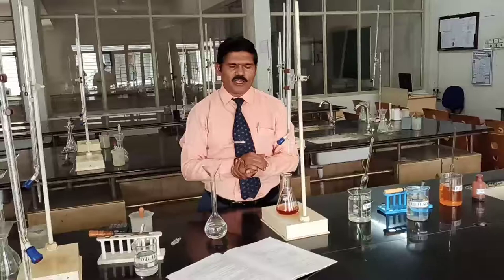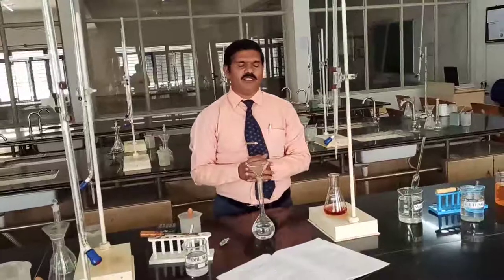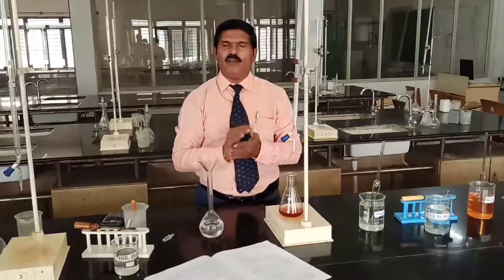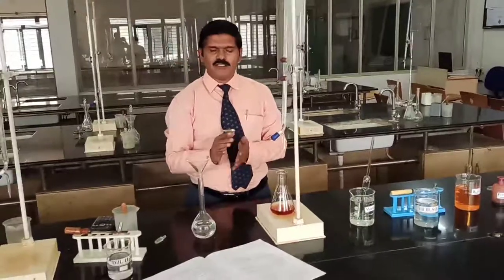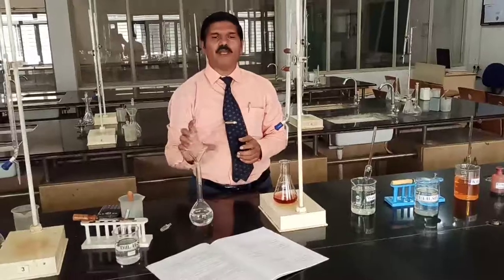The normality of the FAS solution is calculated as: weight of FAS crystals multiplied by 4, divided by the molecular weight of FAS, which is 392 grams. We multiply by 4 because we are preparing the solution in 250 cm³ (250 × 4 = 1000), so we normalize to per dm³. After preparation, transfer the standard FAS solution into the burette.